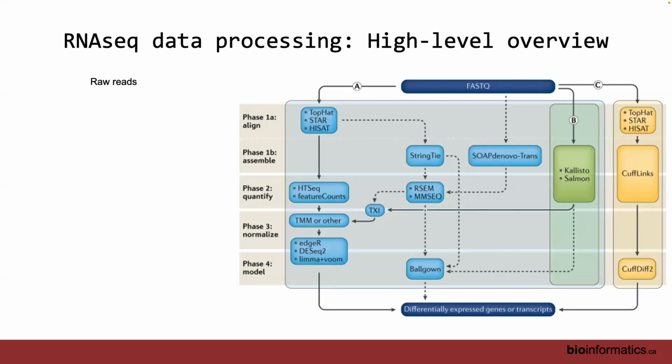Thankfully for all of us, the informatics community has agreed on a set of standards to represent these data types in particular file formats that speak to the different stages of the processing. So the field agrees that the reads that come off the sequencer should be represented in a FASTQ format. What is a format? You can just go look it up, right? The point is, in informatics, we love our file formats. We are awash in file formats.